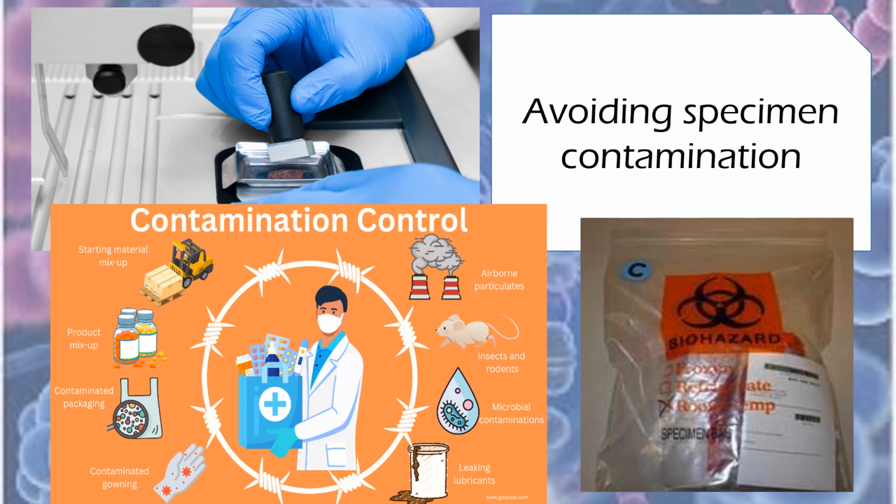Avoid specimen contamination by using only sterile containers and observing aseptic precautions. Wear protective equipment, and clean surfaces regularly.